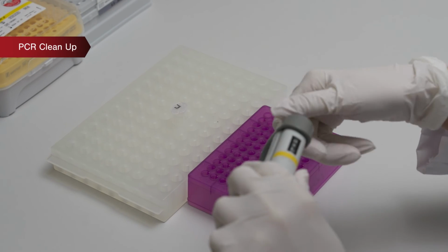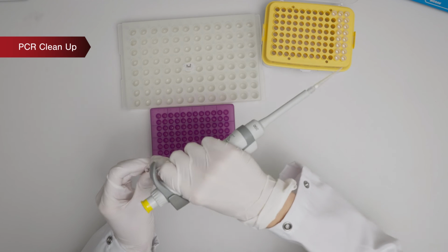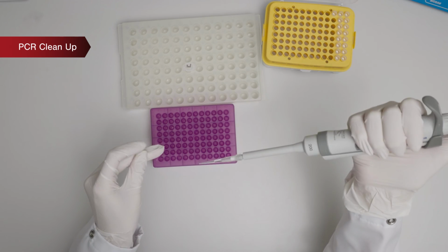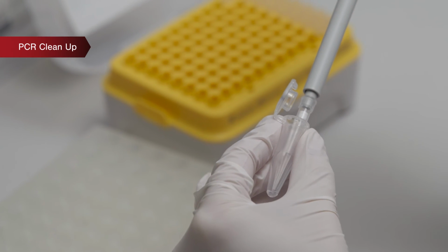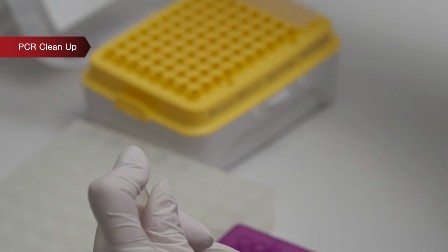After the stop reaction, samples need to be transferred to new 1.5 ml low bind tubes, and another cleanup with magnetic beads is performed as previously described. The only differences this time are extended incubation time for 10 minutes and increased washing volume, 500 microliters of 80% ethanol.